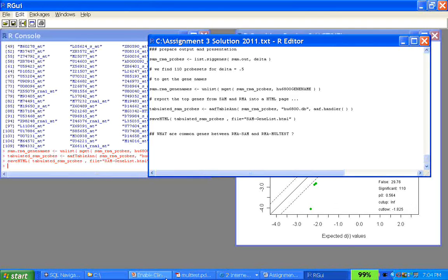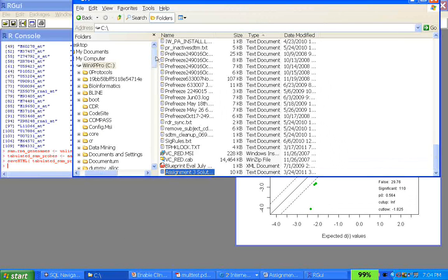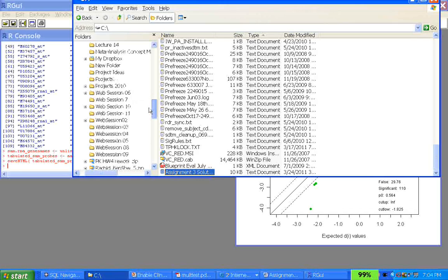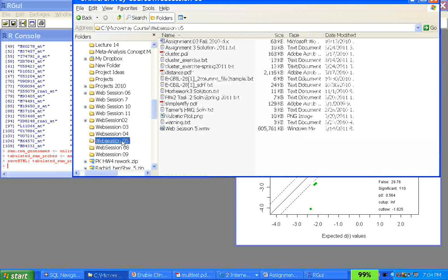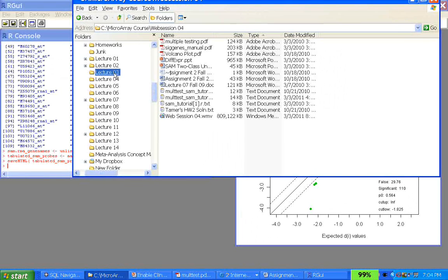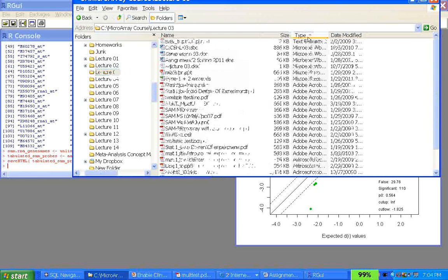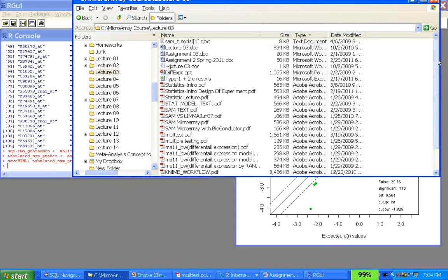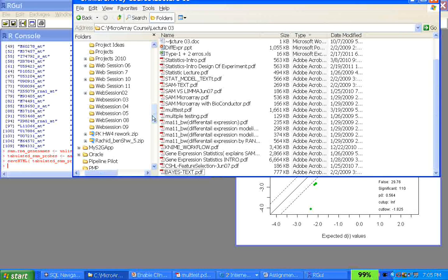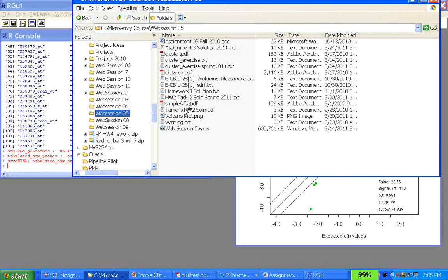And assignment 2, I hope everybody got a chance to look at it. I think I sort of lost gear when I was reviewing assignment 2, and I may not have said a few things correctly. But in the homework solution that I uploaded, and I don't know where I uploaded that, you should be able to review the volcano plot. I haven't had any questions, so if you reviewed the solution for the assignment, the volcano, let me see if I can open it.